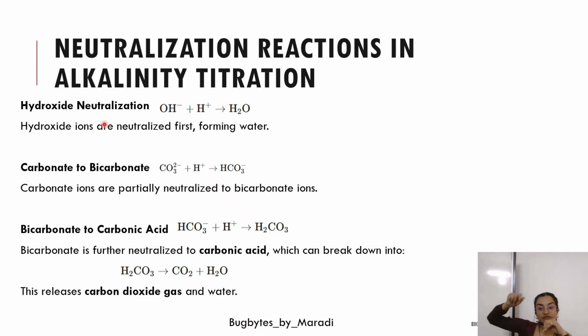When you are titrating against acid, your water sample, if it contains base, starts to neutralize. That we'll be measuring. So the neutralization reaction of this particular alkaline water is what we'll be discussing right now.